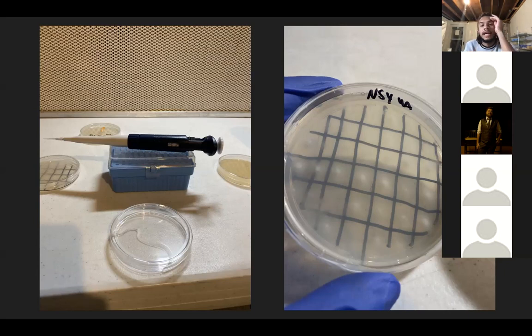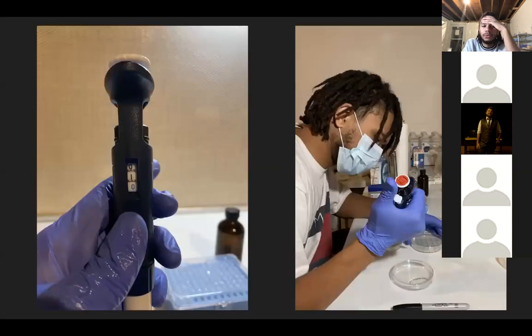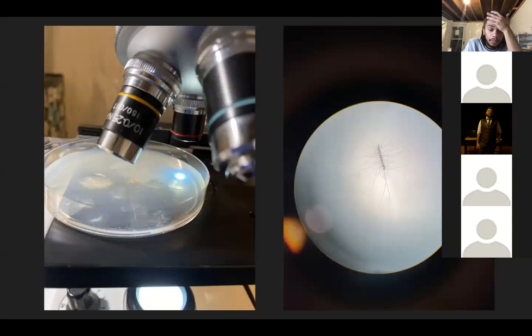But one thing that I noticed that happens with serial dilutions is that the spores will become fragmented. They'll break, which can decrease the viability. So what I recommend the most is, once you have spores dropped on the petri dish, look around the edge of the petri dish with your microscope and try and find a single spore. The single spores on the side will look like what you see here.